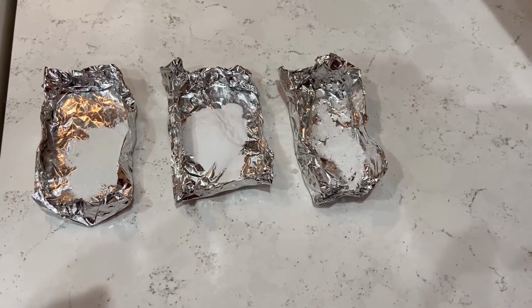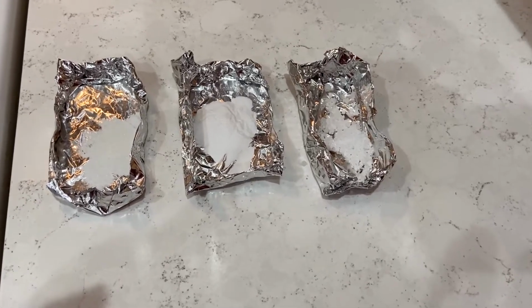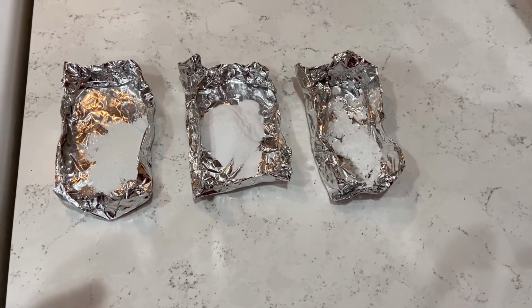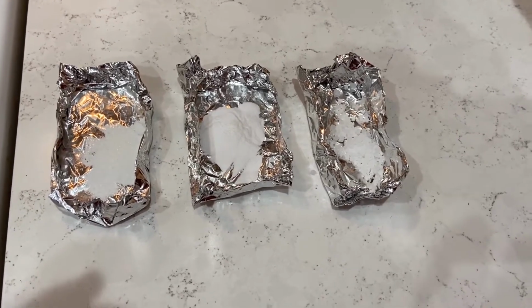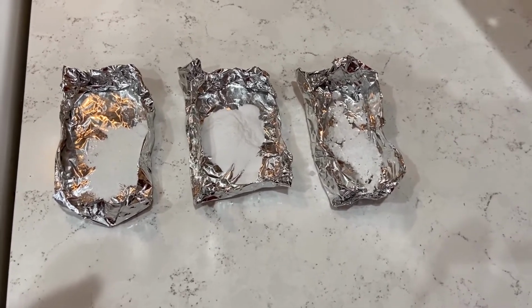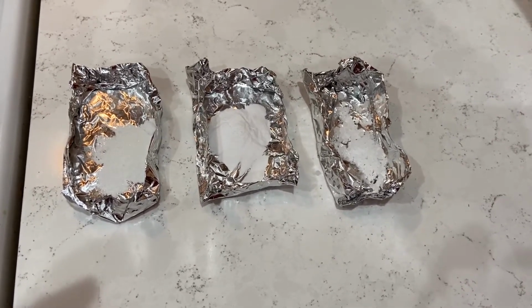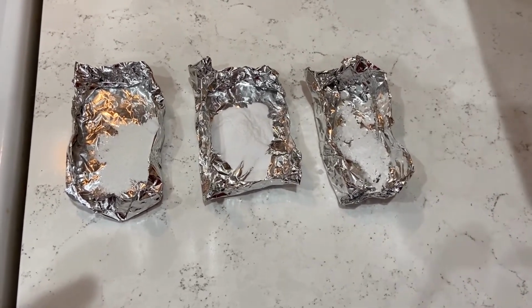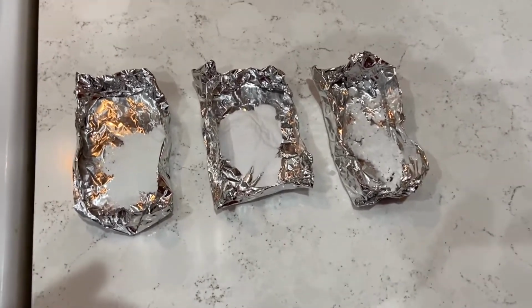Hi, today you're working on the Determining Bonding Types lab. This will be a lab that we're doing to look at the intermolecular forces between molecules or within molecules. So you've read it, hopefully looked at the lab sheet, read some background information, looked through the vocabulary and other activities that are part of the pre-lab.